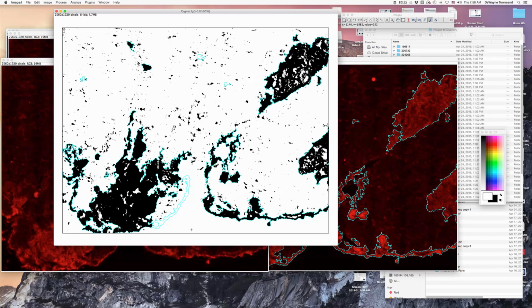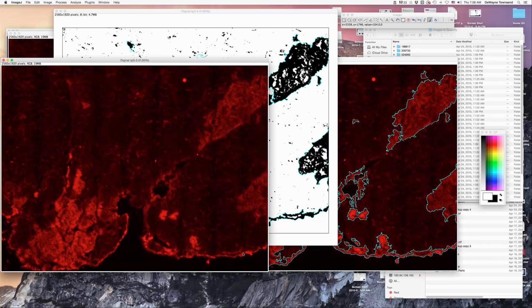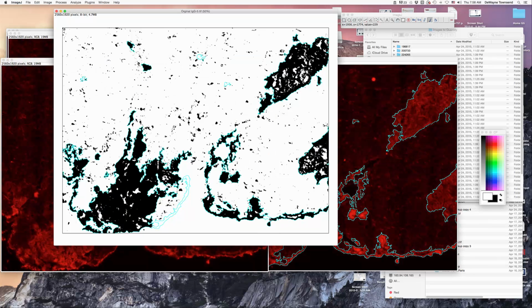Okay, that's one area there. Now looking over here, we have to assess what we're going to count. I'm going to basically remove all of this. I think none of that is positive myocytes. So starting here, working our way over this way.